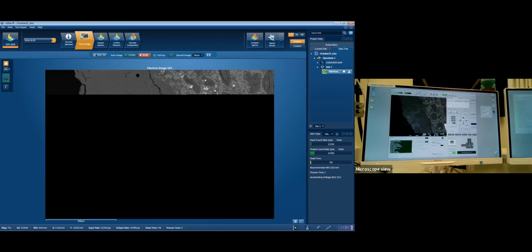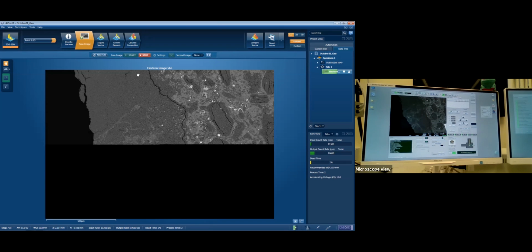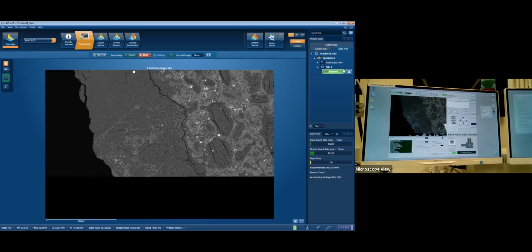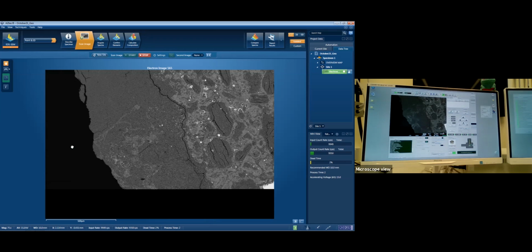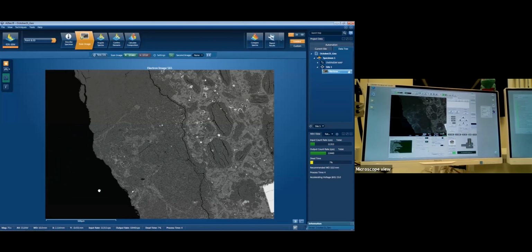It will pull it across here. So this is the same image that we're seeing on the microscope. But through here, we can start doing some little bits of analysis. All this black stuff around the edge is the resin that we have our samples stuck in, because we don't want it falling off anywhere. So already in this picture, we can see quite a few different things happening. We've got this big wiggly bit through here, some chunks of stuff, and some light colored material.